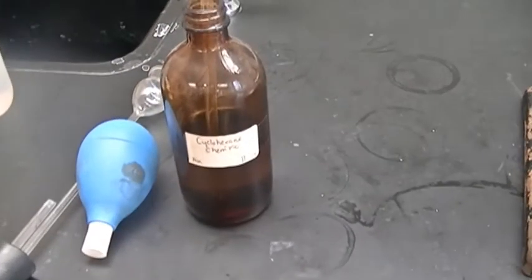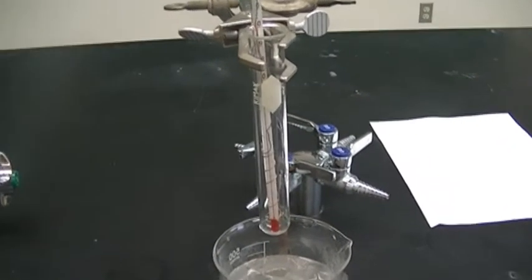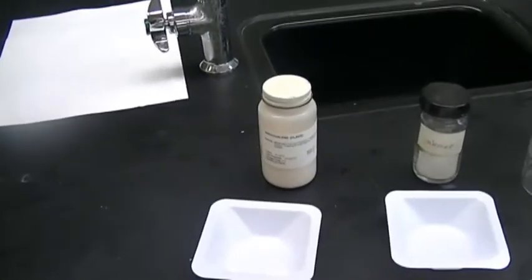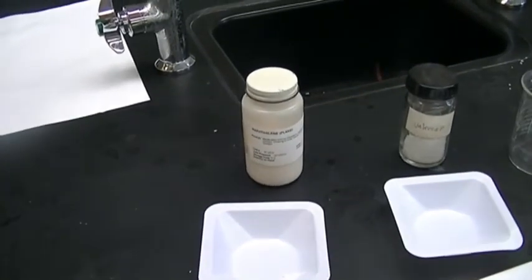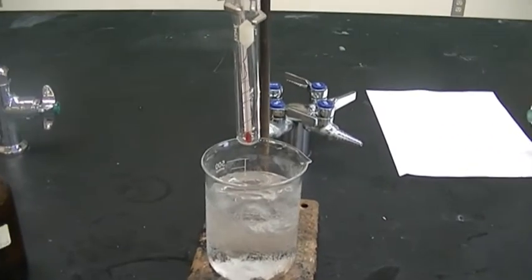And so in here we have our cyclohexane, we have our pipette bulb. We're going to pipette out 10 mils of cyclohexane, and we're going to freeze it. Once we have that, we are going to warm it up, and we are then going to add naphthalene and dissolve naphthalene into our cyclohexane, and then we're going to freeze that.